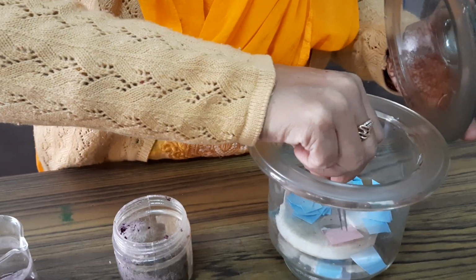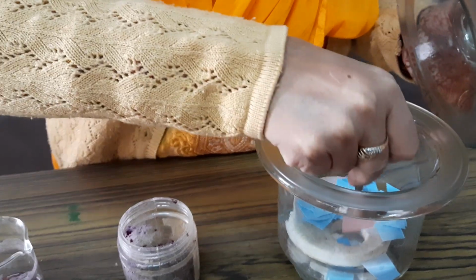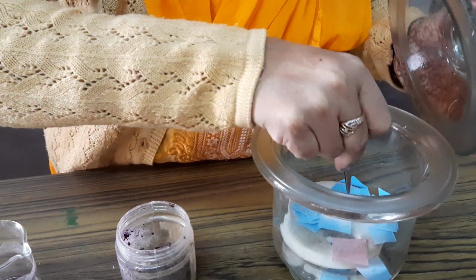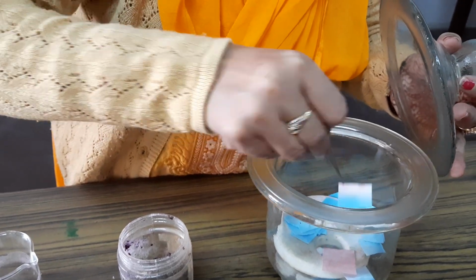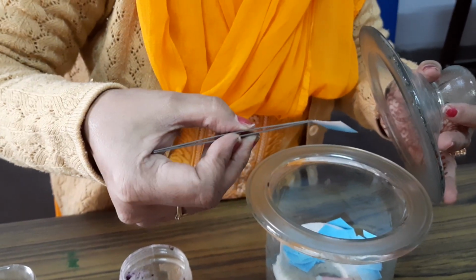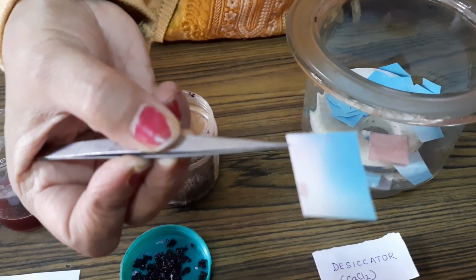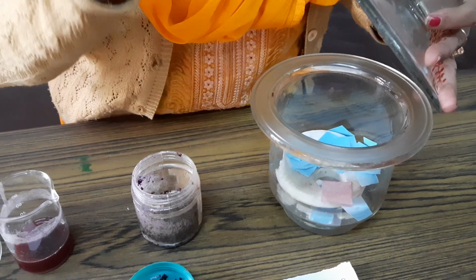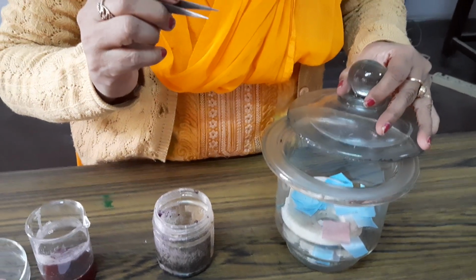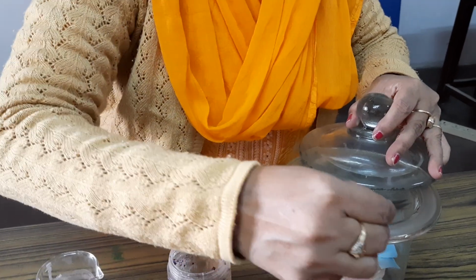You can see here, one of the papers I have kept, it is pink, and I will place it here. Okay? Then one more paper I have placed a little early. You can see this also. Half of the paper is pink in color and half of the paper is blue in color. Originally I have taken pink paper, wet paper. Now I have applied the Vaseline here.